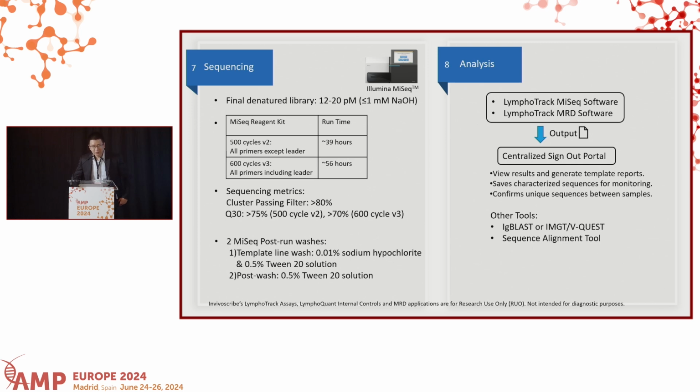Other tools that we can use for analysis are IgBLAST or IMGT to analyze sequences in detail, and a sequence alignment to compare sequences manually.